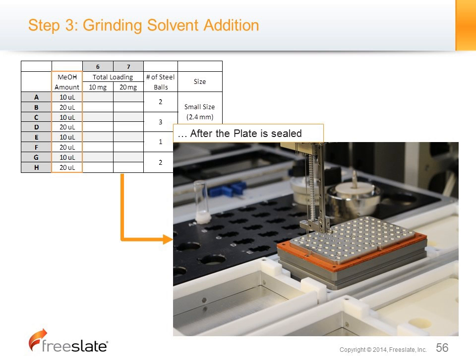Great. And final question: have you conducted many screens on more complex systems, for example, larger molecules? No. The study we have done for real is still within the small molecule realm. It's not a large molecule. But I don't know what you mean by complex, but it's small molecule. It's a small molecule with variables. In this case, it's 8 grinding solvents and 12 coformers. That is pretty focused, through calculation, and based on that calculation, the 12 coformers were picked. Okay. So by complex, the question meant pharmaceutical molecules. Absolutely.